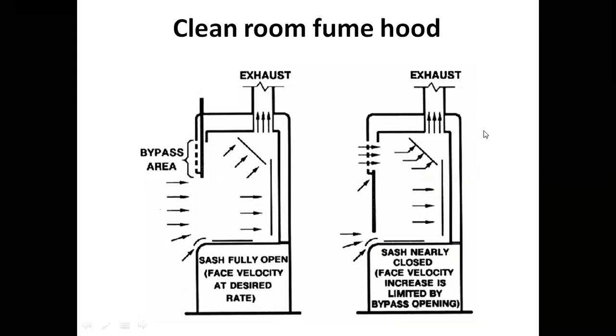Fume hoods. Also in the clean room we would have fume hoods. Fume hoods are used when you are working with dangerous acids or bases, or you mix different solutions where dangerous vapors are produced, which are very harmful for the users working inside the clean room.